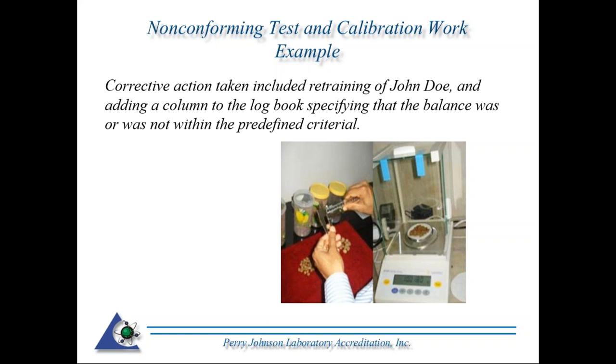99.9995 and the 100.0005 gram specified. So that was determined to be the root cause of the corrective action. Hence, hopefully, by addressing the root cause, this would greatly reduce the likelihood of this having to occur again.